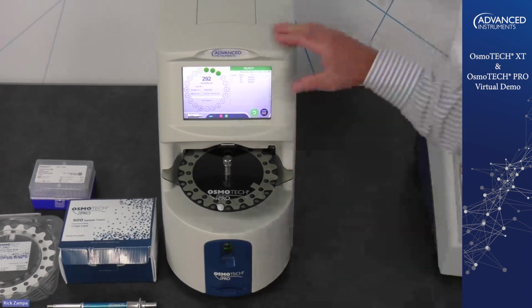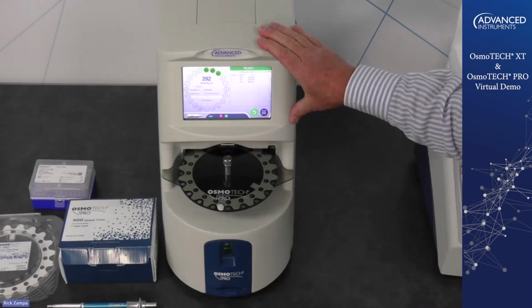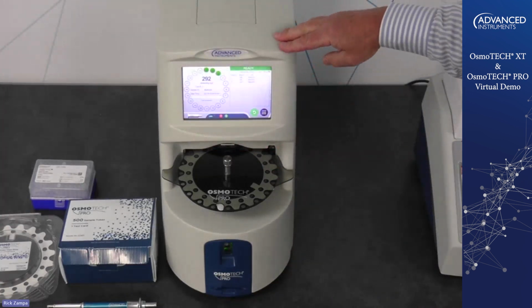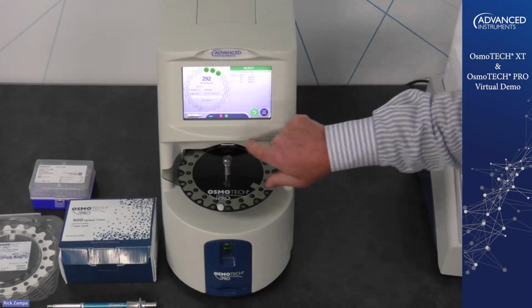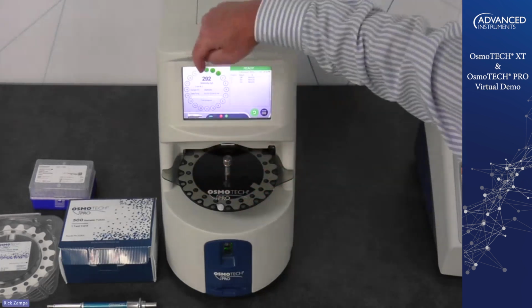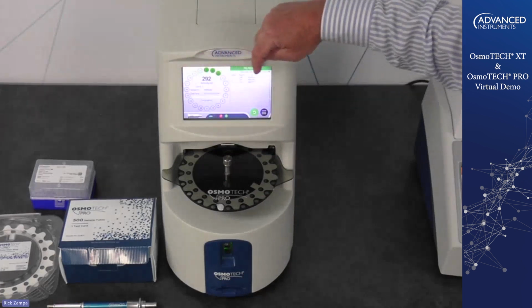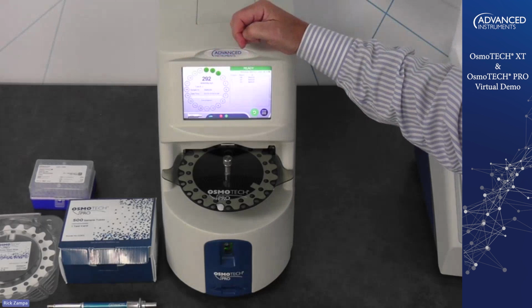Okay. Nope. Okay. OsmoTECH Pro here. So you can see this is a multi-sample instrument. We have our touchscreen display here, very much set up the same way as the OsmoTECH XT. We have our menu button. This is our load button. We have our sample counter here again. You can see the results here displayed in the carousel, as well as a list over here. You can see our last test result there.